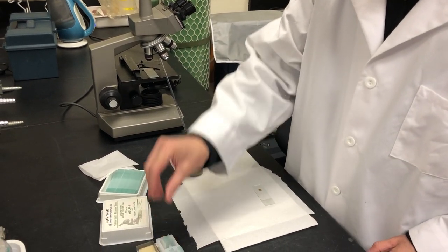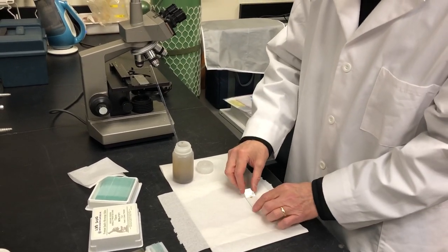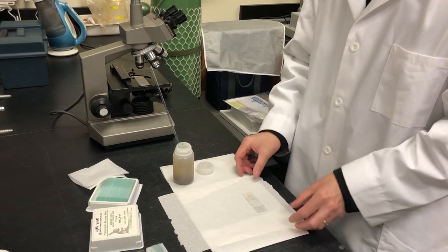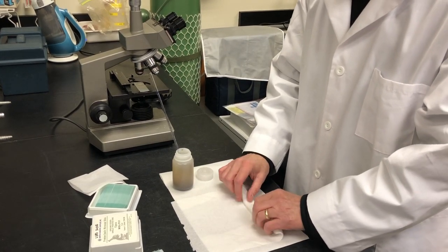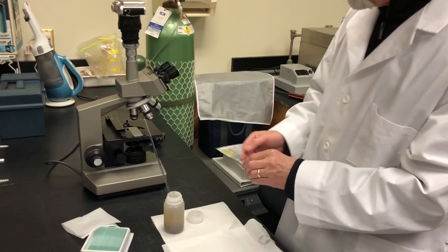Take a clean cover slip, grabbing it by the corners so as not to put your fingerprints on it, and at an angle you're going to set it on there and then drop it. Now the next step will be to get rid of some of the excess moisture. What I like to do is just fold it in a paper towel like this, give it a quick rub, and here's my prepared slide.